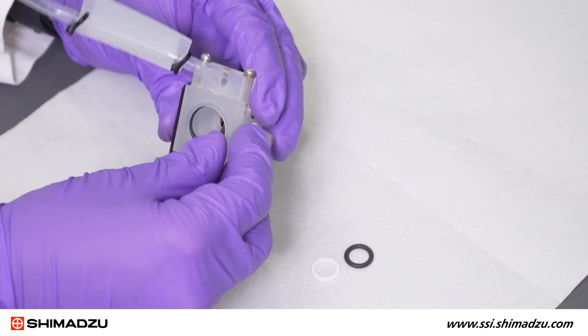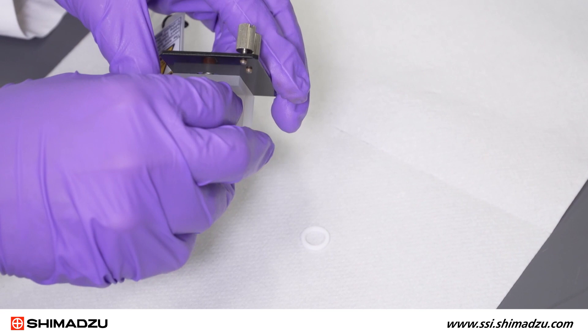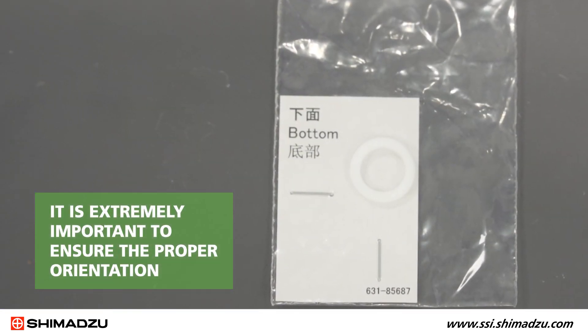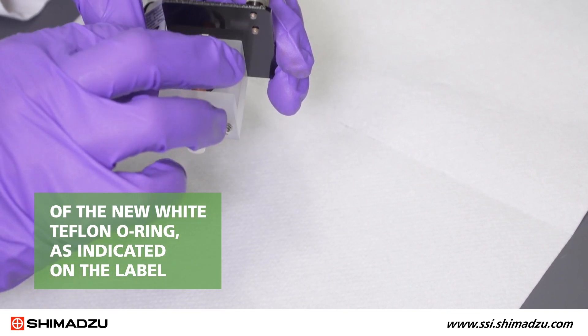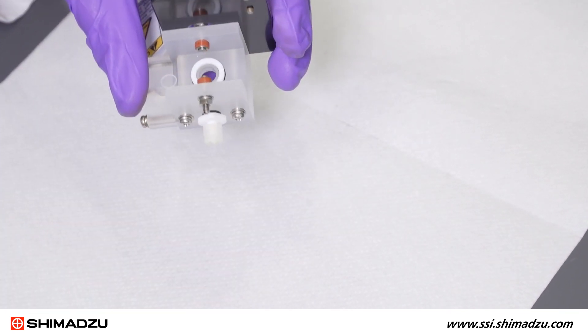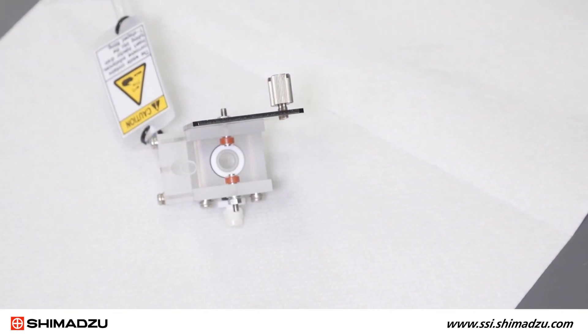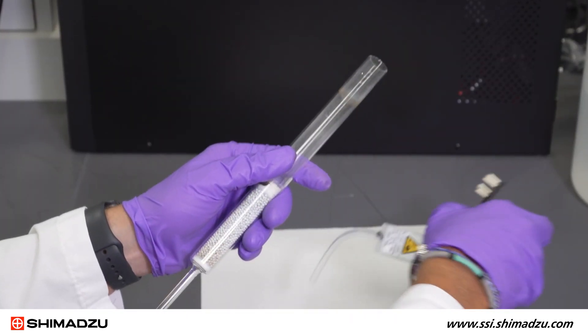Now, the new O-rings can be installed. It is extremely important to ensure the proper orientation of the new white Teflon O-ring as indicated on the label. One side of the O-ring has rounded edges and should be installed with this side facing up.